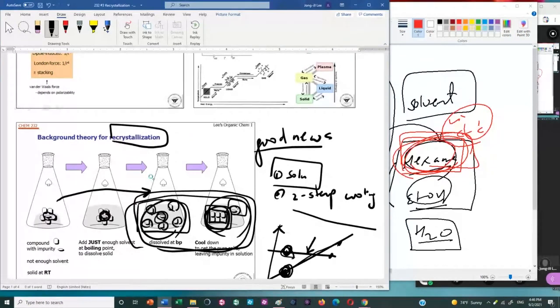You dissolve them, you break them apart. That's one main goal. But we have to get it back. You cannot get the solid back because they are soluble. Because of this step, hexane's not good. You understand that now, right? So again, the exam question is not simply how do you find a good solvent? Dissolve, cool, not only that, explain. Then you have to know how to explain why hexane's not good on the practical side.